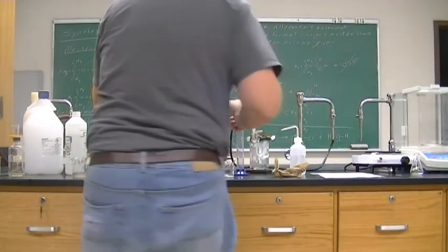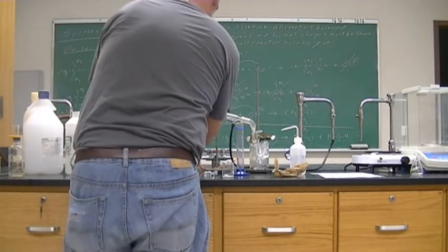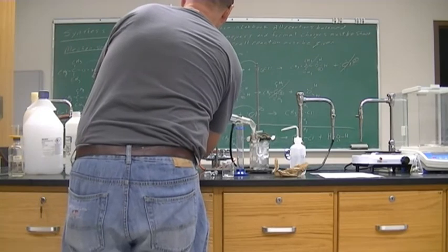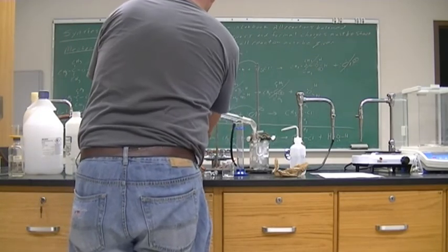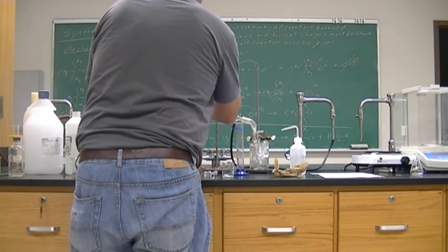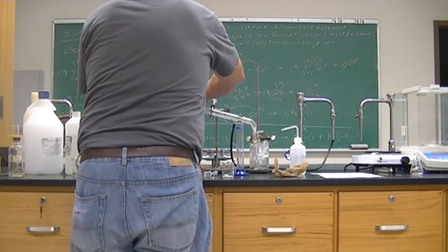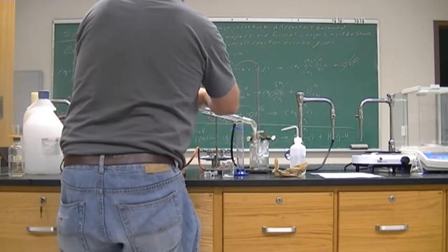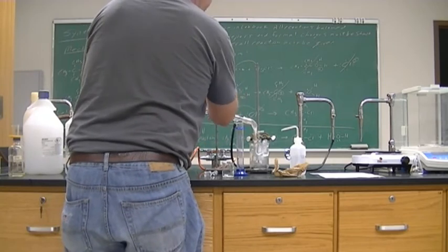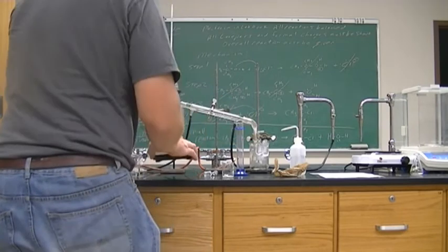This distillation is going to get us our boiling point more than anything else. It will purify our liquid as well. We did a lot of washings, we did drying. This is high purity, and if we had our NMR up and going, we could take the NMR and see if there are impurities in it.